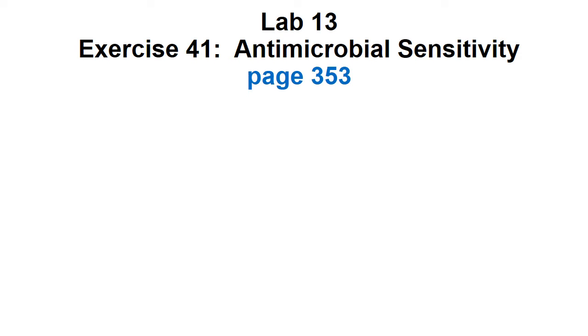Lab 13, Exercise 41, Antimicrobial Sensitivity Tests. You should be on page 353 of the lab manual. We'll now be looking still at microbial control, but now we'll be looking at the use of basically antibiotics, which are a type of antimicrobial. You should read pages 353 through 364.